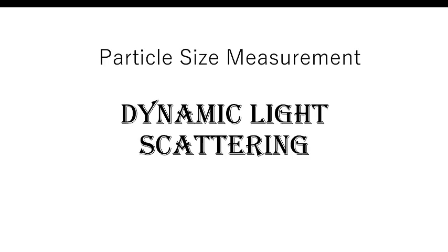Particle size is one parameter which can influence many properties, and therefore accurate measurement of particle size is very important. In this video, we are going to learn about a particle size analysis technique which is very effective in measuring particle size. The technique is called dynamic light scattering, or DLS in short. Why it is called dynamic, that will be clear in a moment as we progress.